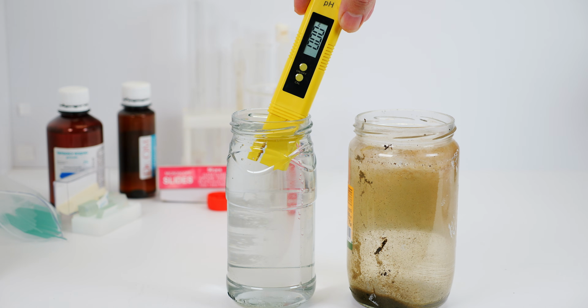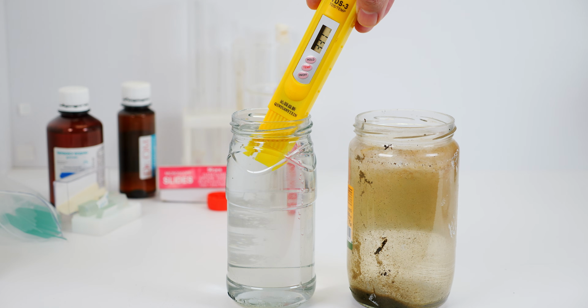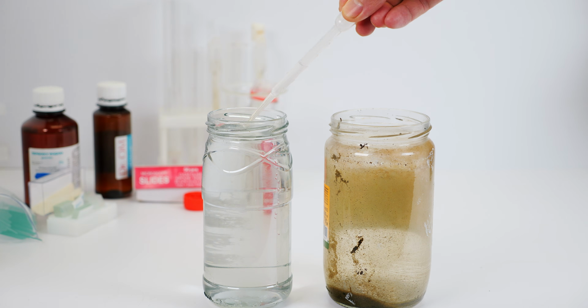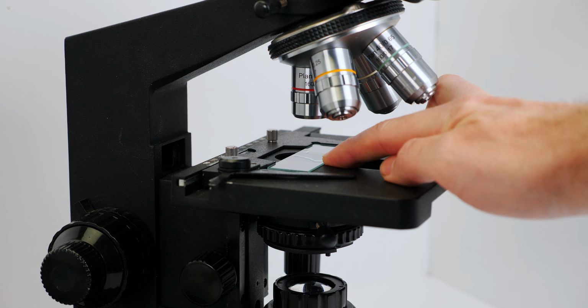The pH level dropped from 7.13 to 6.50, but the level of impurities barely changed. From 400 parts per million, it only went down to 333 parts per million. We draw this water into the pipette, place one drop on the microscope slide, and put it under the microscope. Now it's time to observe what actually changed. So far, I can see that the water has become much cleaner, although there are still particles of debris inside it. In other words, this tells us the filter lets microscopic debris through.